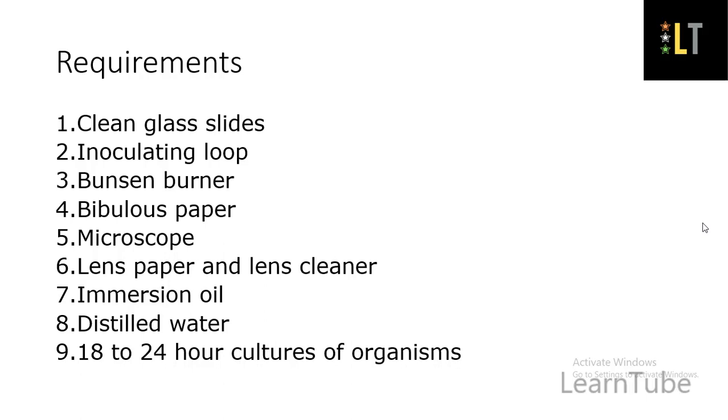Immersion oil, which includes either white liquid paraffin or cedar wood oil, distilled water, and 18 to 24-hour cultures of organisms.